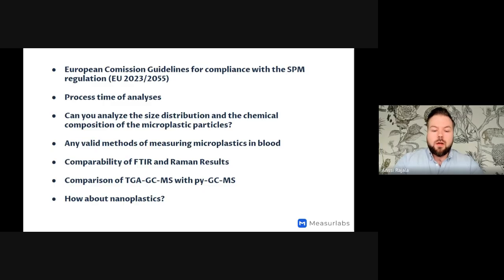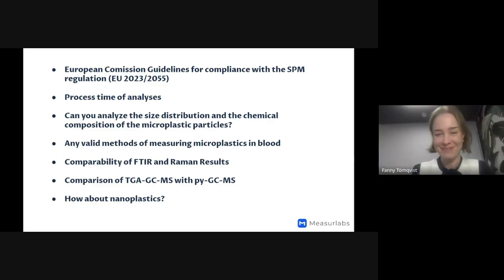So they are digested with hydrogen peroxide beforehand, and then they are concentrated and filtered with ultrafiltration.